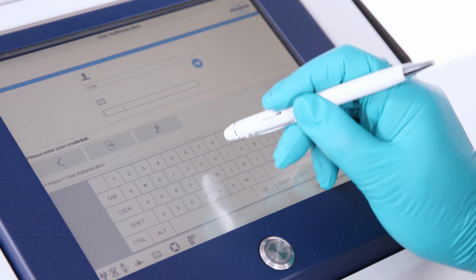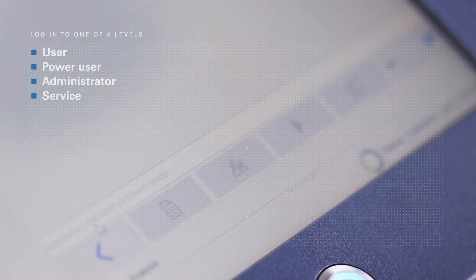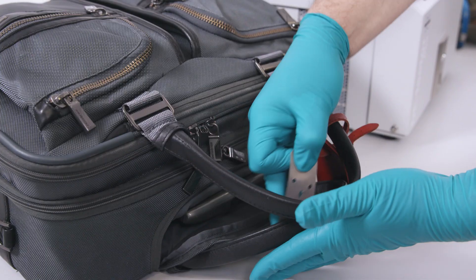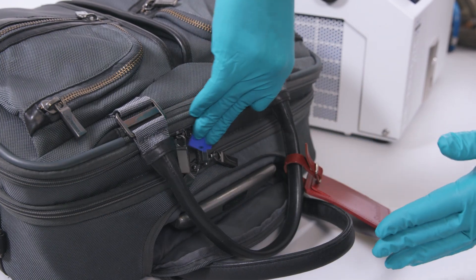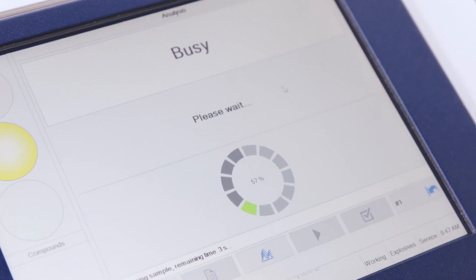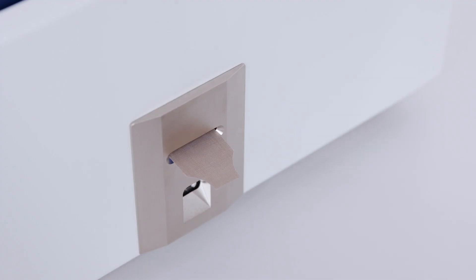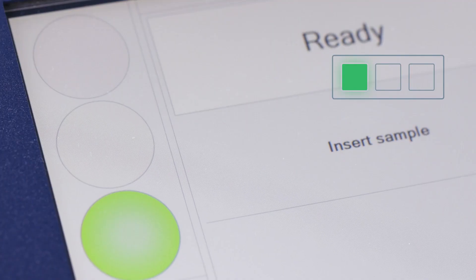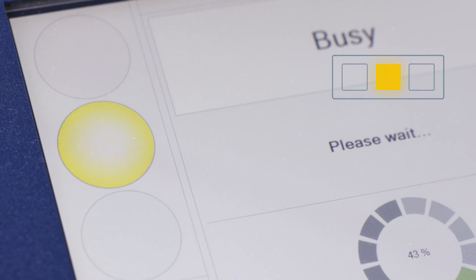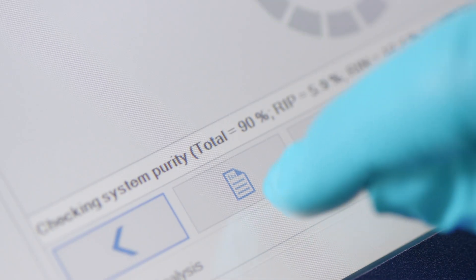With the equipment switched on, the software starts automatically. Log in to the user level. To test a sample, swab the target and then insert the sampling strip into the inlet. Analysis starts automatically with progress shown on the screen. You will then be prompted to remove the sample. A result is obtained within 8 seconds using the traffic light system, and a report is generated automatically.